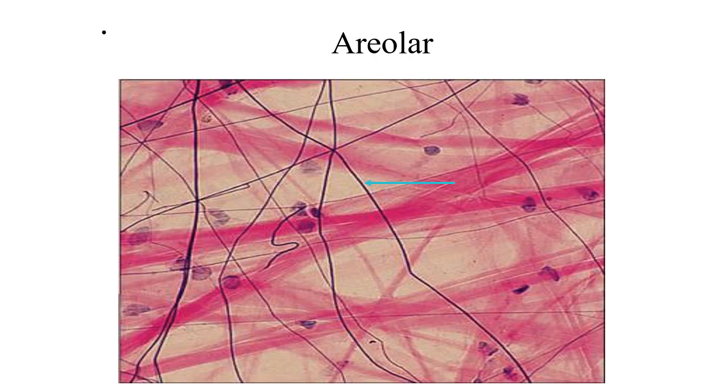Now we have a connective tissue that has fibers. And not only does it have fibers, but it also technically has all 3. And so now we can start to see here, we have an elastic fiber. Here's another elastic fiber. And so elastic fibers tend to stain really, really dark. They tend to be nice and uniform in their diameter, so they have a uniform diameter along their length.